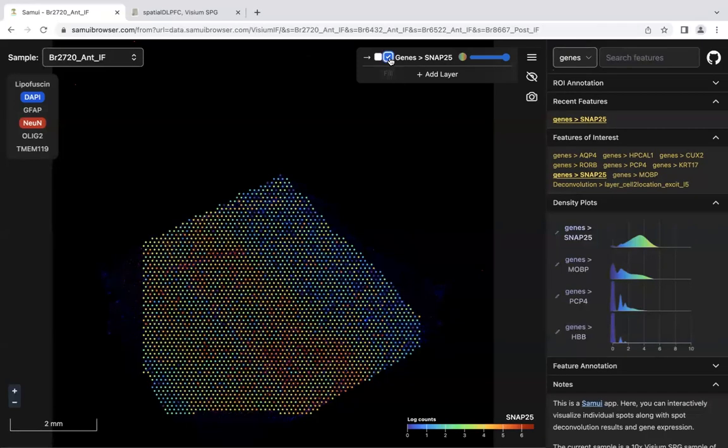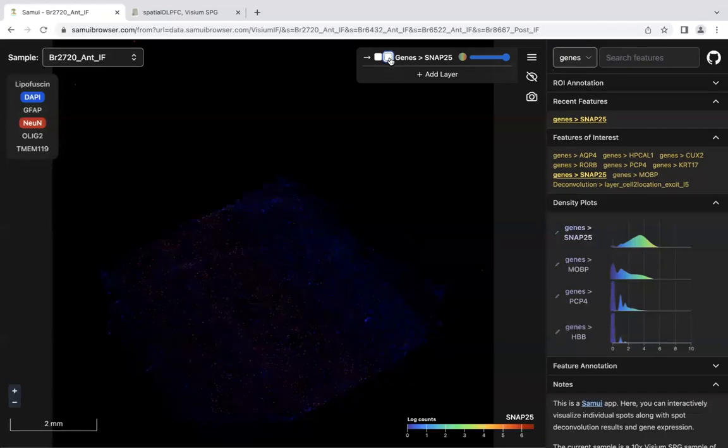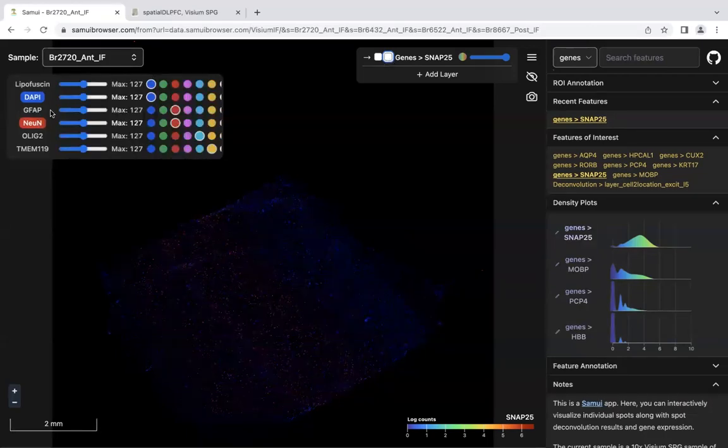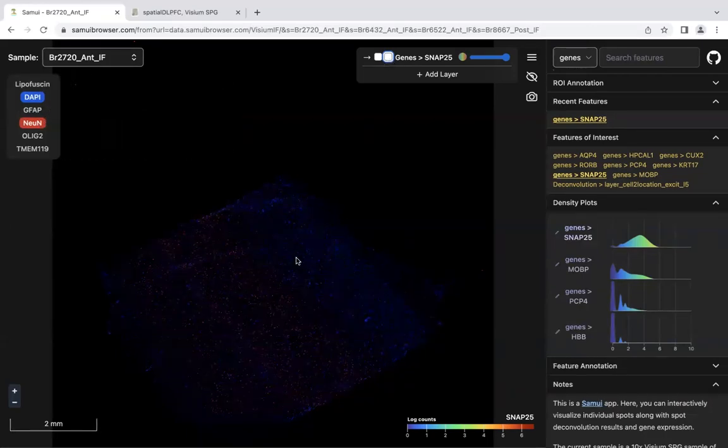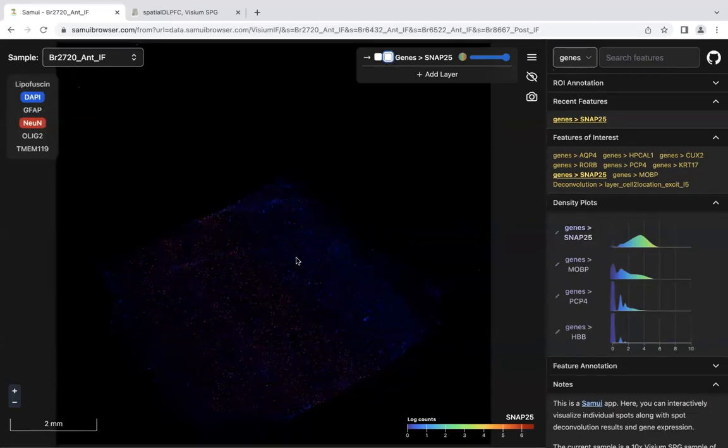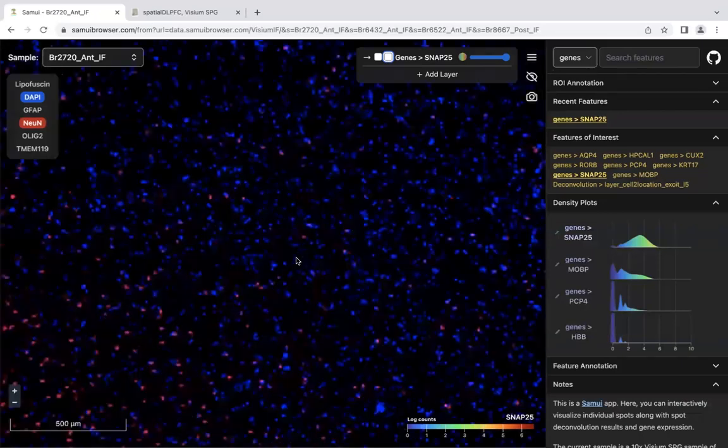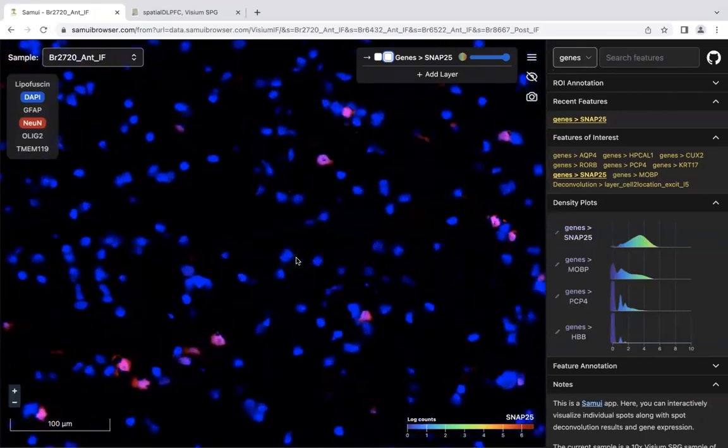For now, let's take a look at the raw fluorescence of the image. Right now, we have DAPI and Nguyen selected. We can zoom in arbitrarily on this full-resolution image for this sample.